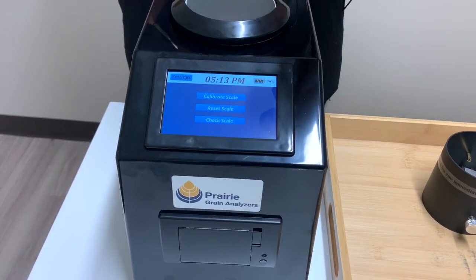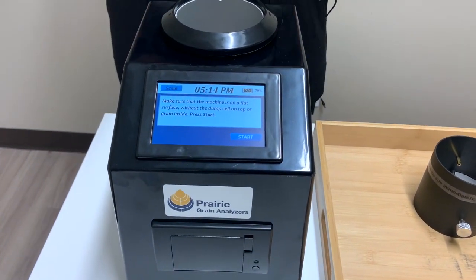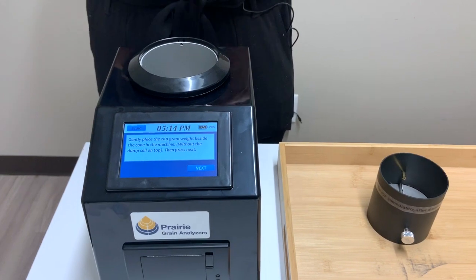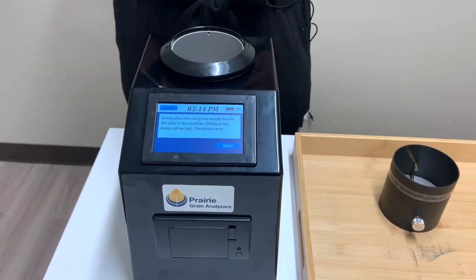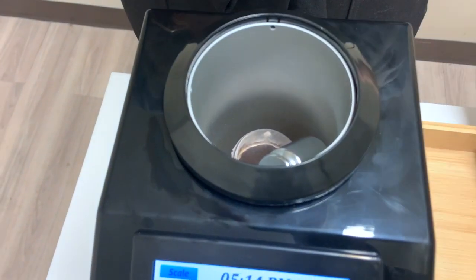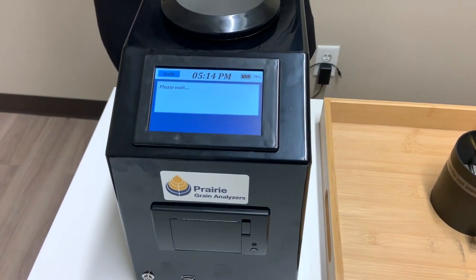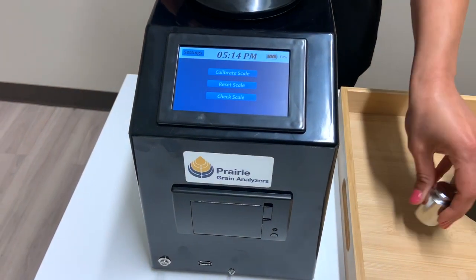It says 'calibrate scale' and you want to make sure you have your 200 gram weight with you. Go into the setting — it'll ask you to make sure it's sitting on a flat surface with nothing in the grain cell, then press start. It will then tell you to put the 200 gram weight in gently. You want to make sure you don't drop the weight in because that will damage the cone and the scale. Just place it in gently like this — you don't need to put it on top of the cup. It just needs to sit in like this, then press next. Once it's done, take that out and your scale should be good to go.